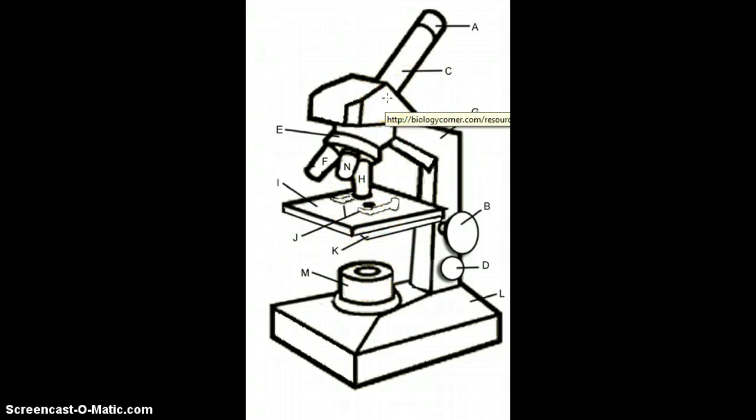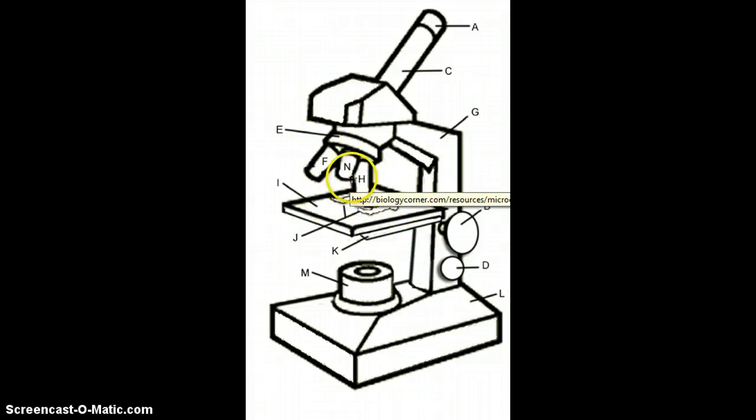I is pointing to the stage with the little hole in it. You have your little slide, you put it on here, and you have that little circle where the organism or whatever is in. The light shines through it, bounces back, and goes back in the microscope where you can see the image.